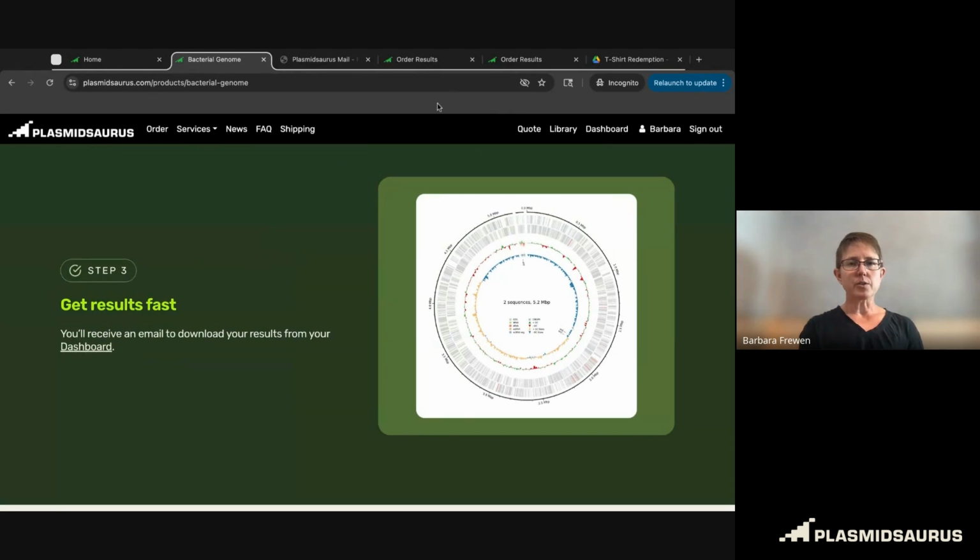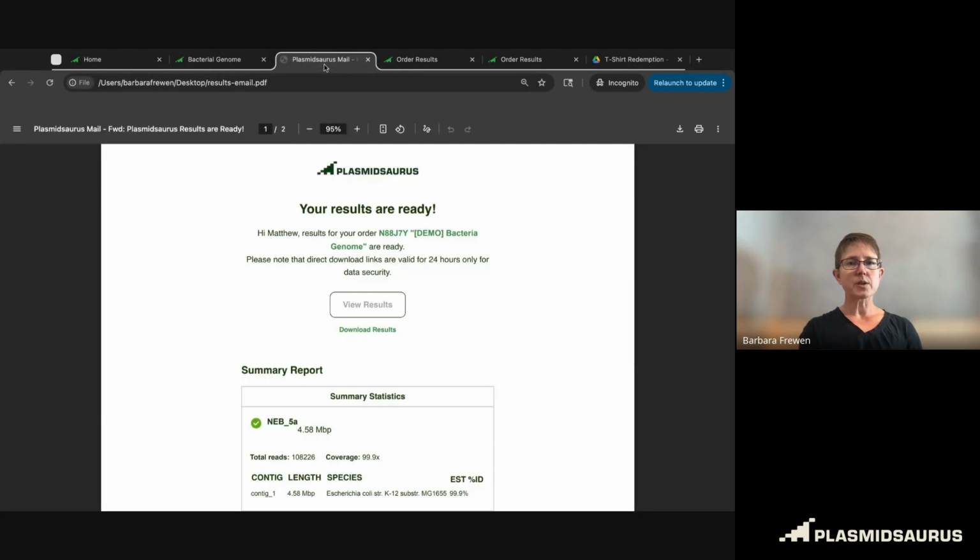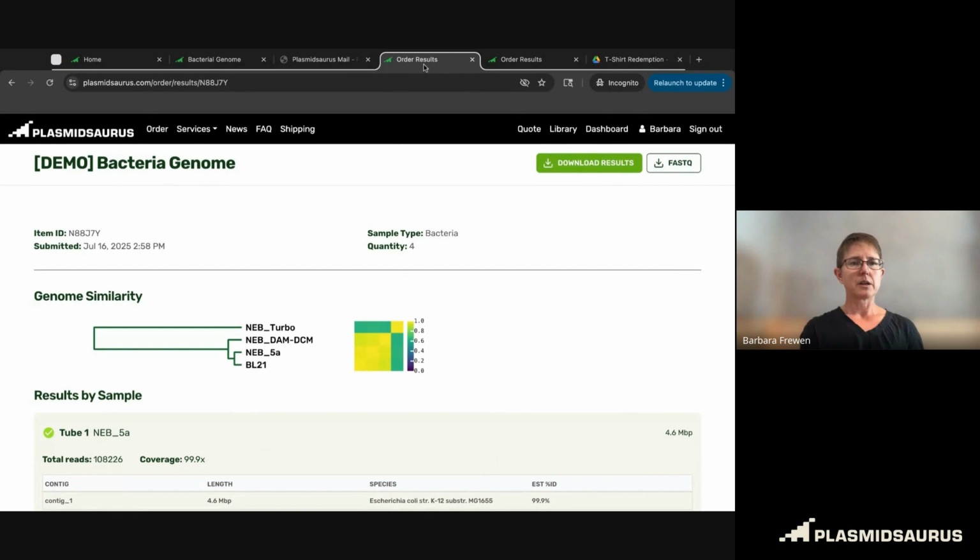So you've prepared some samples, sent them to us, and then what happens? You get an email back that says your results are ready. When you see this, it will remind you what you ordered, whatever you happened to call that order, and give you some options. There'll be a button right here to view your results. That's the page we're going to spend most of our time on today. There's also a button to download directly. So let's go to that order results page right here.